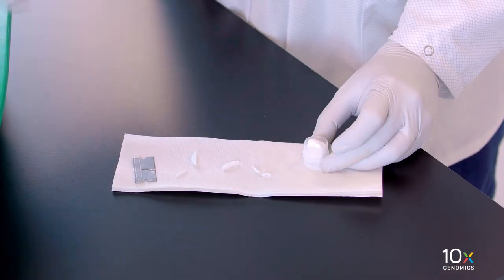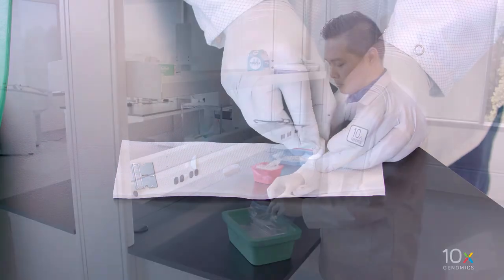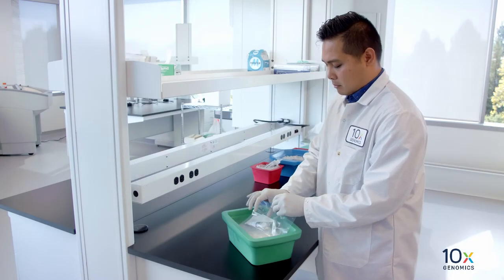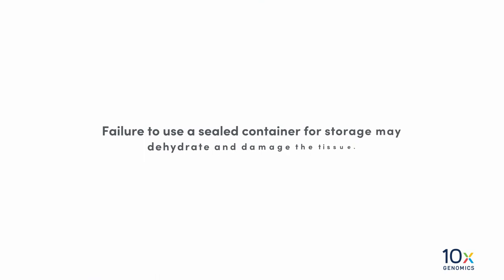Then place the OCT embedded tissue block into a pre-cooled Wheaton Cryoleat cryovial. Alternatively, a resealable bag can be used for storing the tissue block. Failure to use a sealed container for storage may dehydrate and damage the tissue.